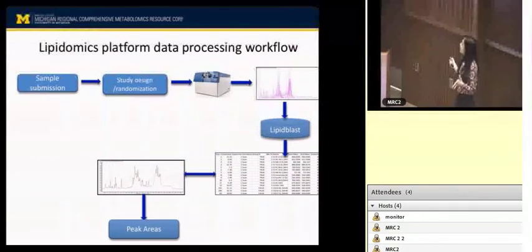And then once we have this, we create a master spreadsheet, like a master library for all the identifications, whatever we see in each one of them. And up to this step, we use MS/MS just to create the library, a master library for that particular experiment. We take the mass, the retention time, and the compound name, and then we create this library.